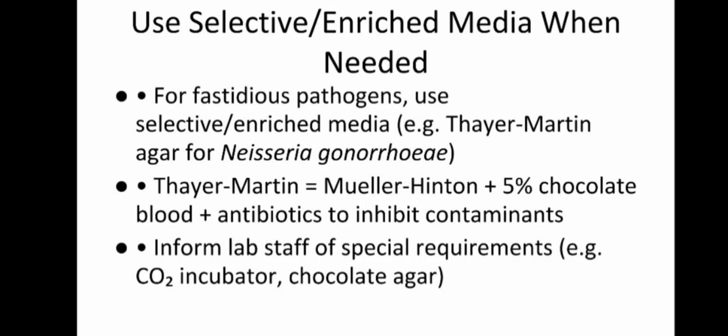If you culture Neisseria gonorrhea in practice, you should always request a selective chocolate agar and CO2, and you have to make sure the CO2 incubator is present beforehand. Similarly, Haemophilus species also need a chocolate agar. Clear communication with lab personnel about these needs is essential, and if you don't inform them, you will end up blaming your students.